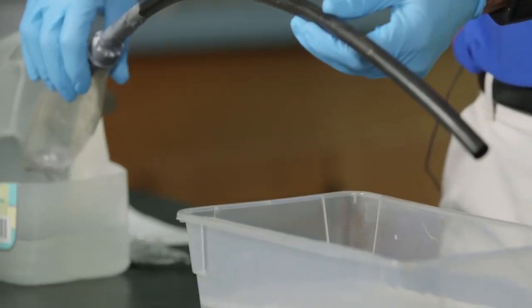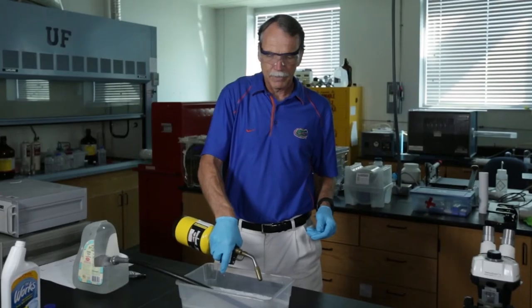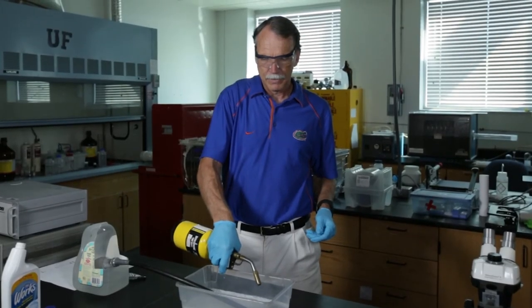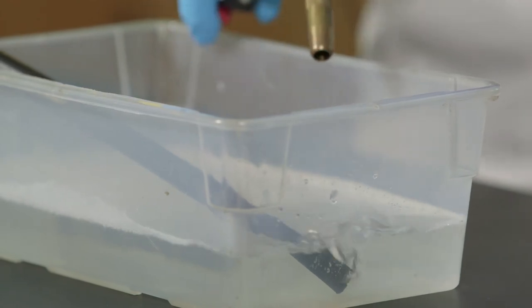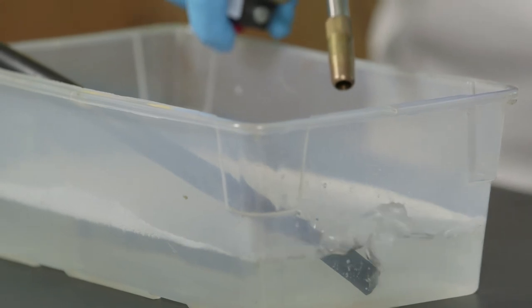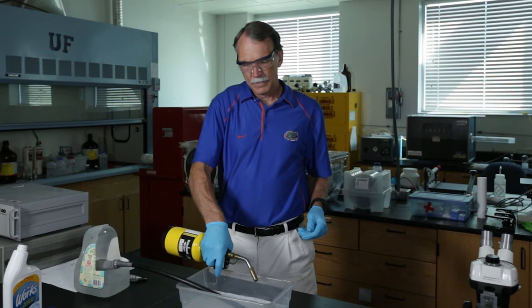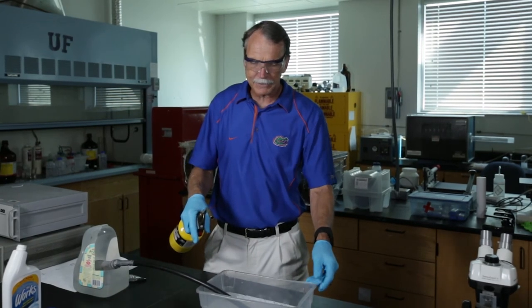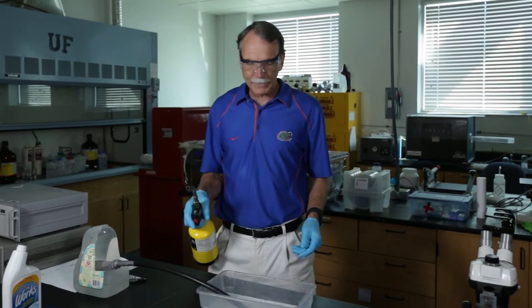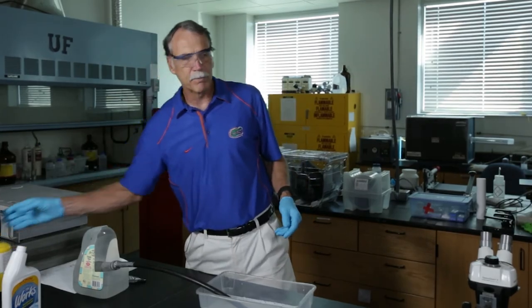There it goes. You can see it's starting to form bubbles, and these bubbles are actually hydrogen. Every time I light it, those hydrogen bubbles are popping. This is a way of showing you that aluminum oxide will only protect aluminum for so long, and eventually it will corrode and go back to its native state.